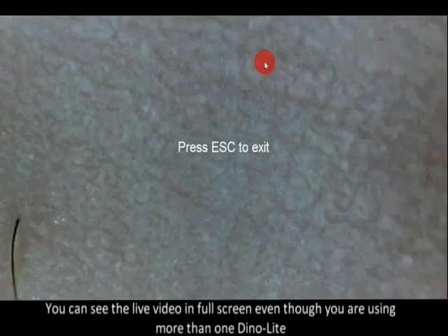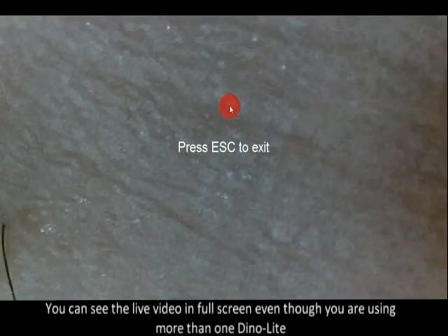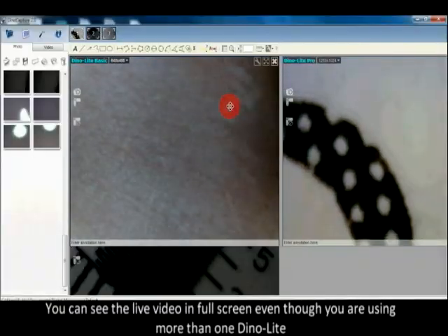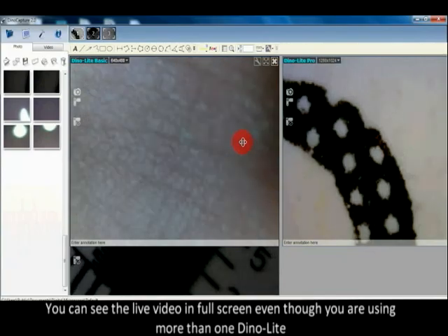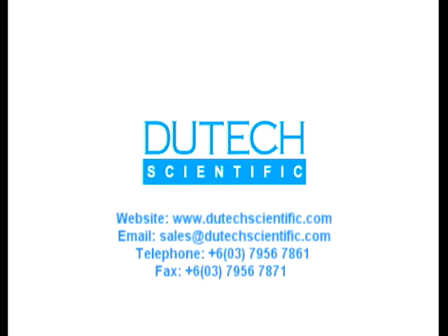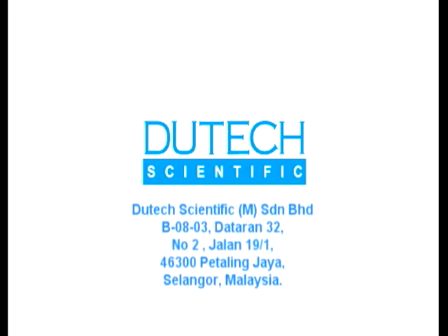You can see the live video in full screen even though you're using more than one DinoLite.